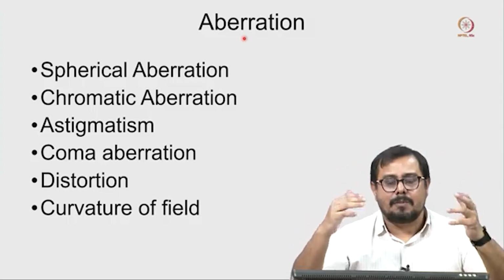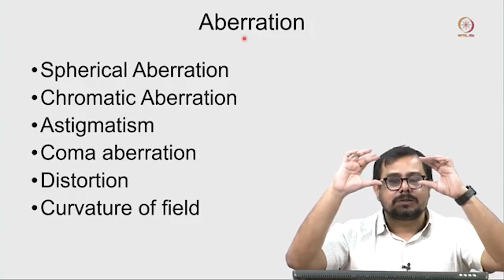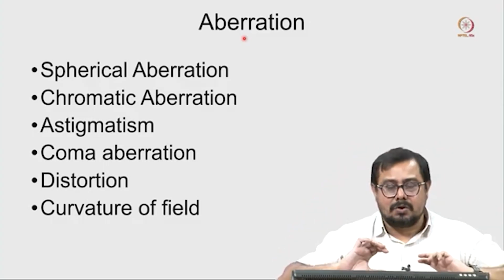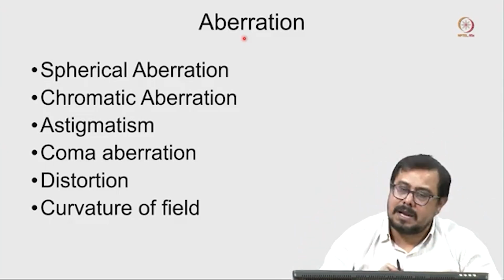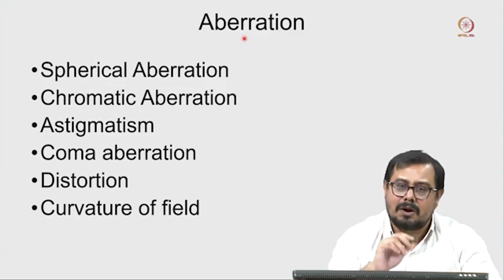If you think about the engineering part, it is very difficult to place those electromagnetic lenses one by one, and then control all this electron beam properly. There will be some kind of aberration, and that is going to affect our images.